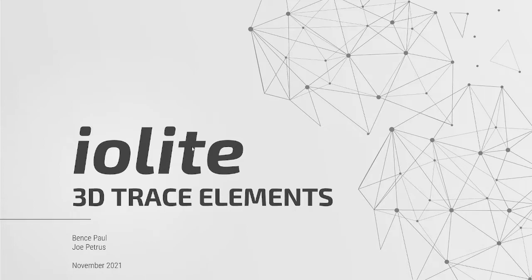So today we'll be talking about the 3D Trace Elements DRS, our new Trace Elements package for iolite. To give you an overview of what we'll be discussing today, to start off, we'll talk about some theory of how we calculate concentrations from mass spectrometry data in laser ablation.